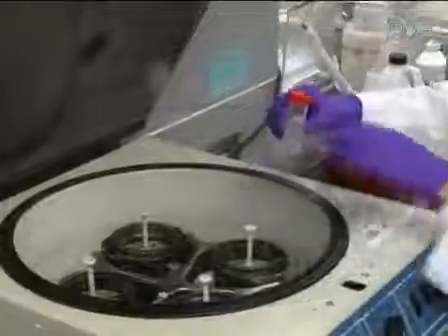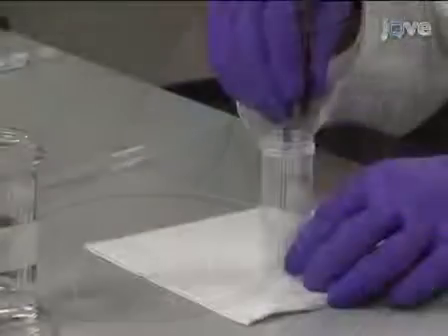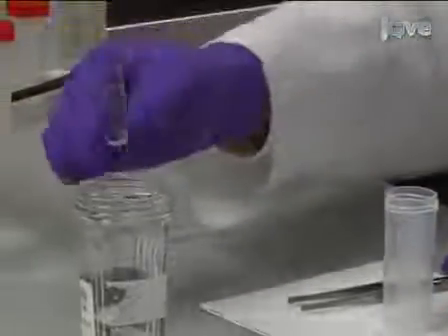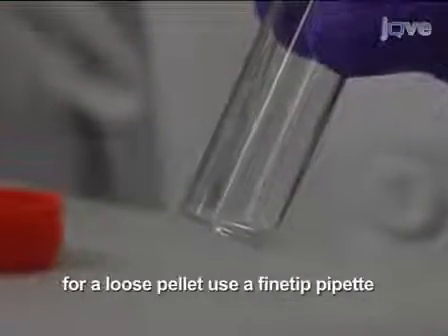After centrifugation, remove the flat bottom glass tube from the plastic carrier tube and pour off the supernatant, taking care not to disturb the flat layer of cell sediment at the bottom.